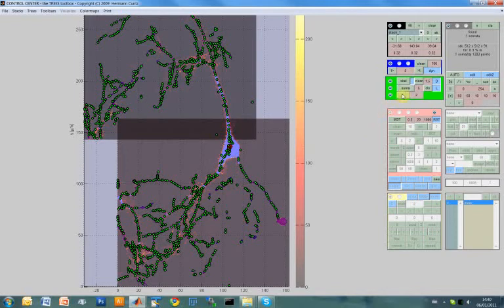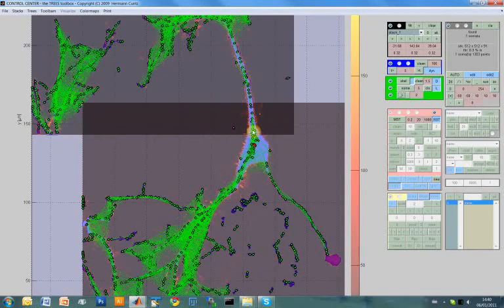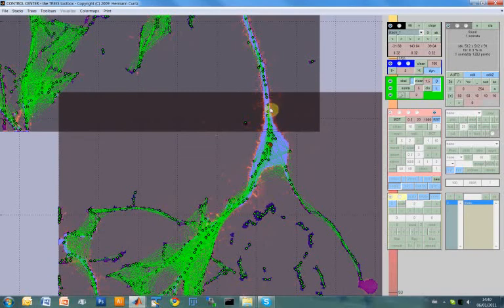Additionally, we can also calculate a graph. I'm clicking here, which says how likely it is that two of those points are connected to each other, and that is calculated such that they're connected if you can go from one point to the next via the thresholded image. So that's a simple way to calculate it for now, and extendable in future versions.